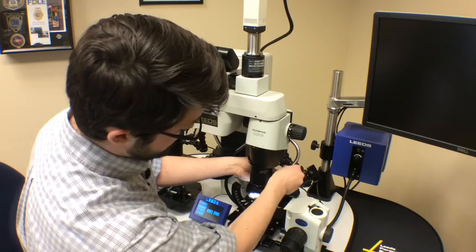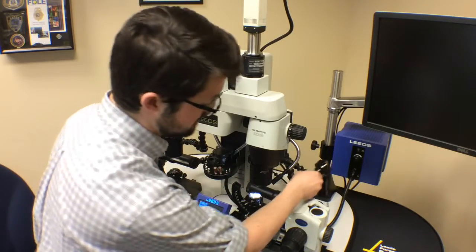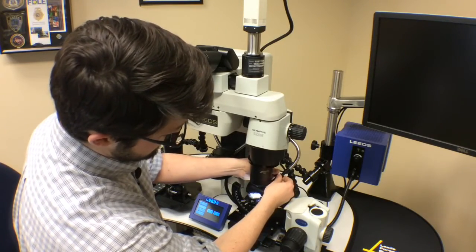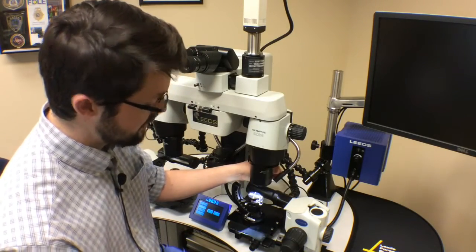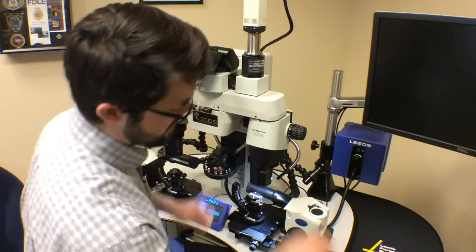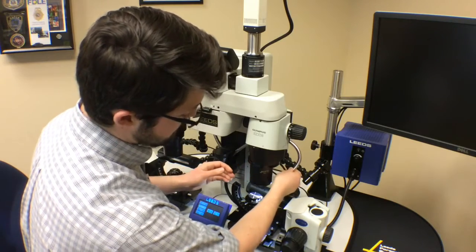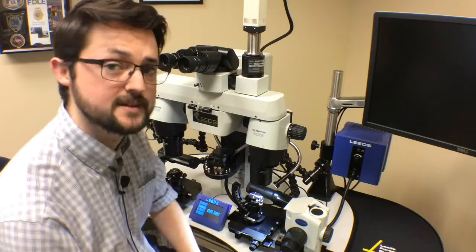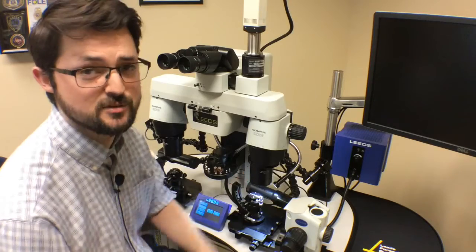What I have equipped on it right now is a spot focusing lens, which presents light similar to the spot LED. It has a little bit different texture to the light. You can focus this lens by moving it — you can make it a very narrow spot beam, or you can widen it out much larger. We also have an optional diffuser which can be inserted. The diffuser changes the texture of the light, softens it to be more similar to the fluorescent quad lamp, reducing some of that glare and making just a general softer light source.